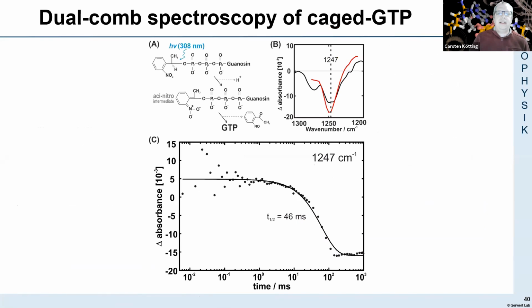Yeah, and we measured that on February 1st with the new dual comb technique, and we get a very similar half-life time of the reaction. However, the measurement was done within 1 second instead of 5 hours. And it's really just a one-shot experiment, and we get the data out of it.